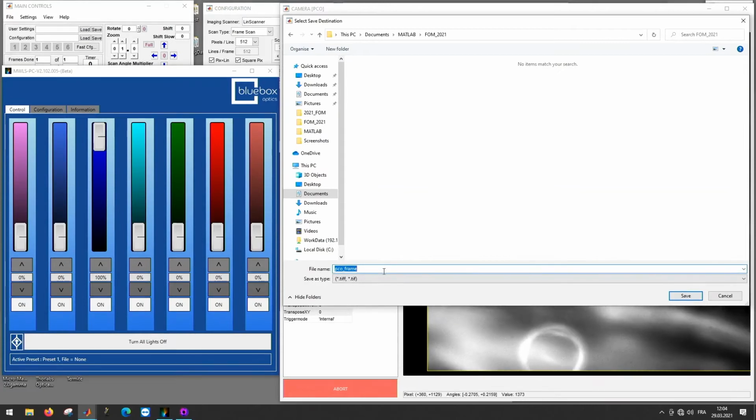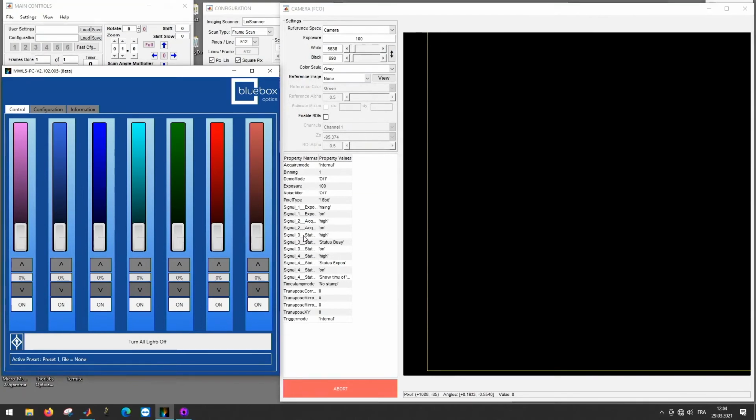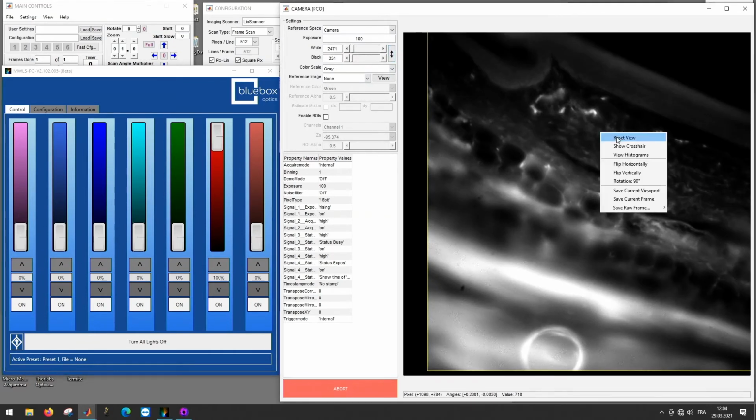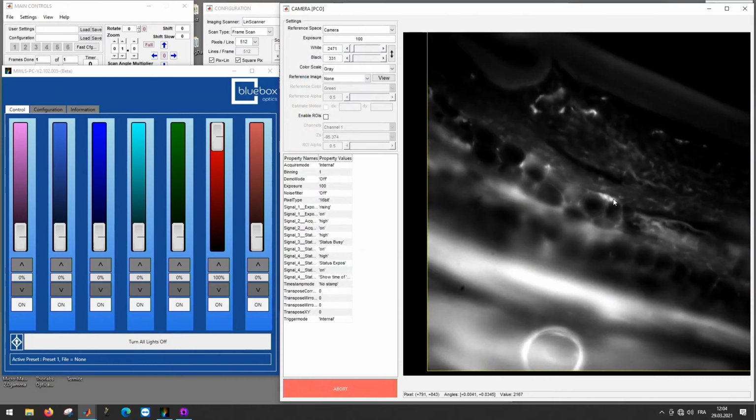All the images that you acquire with this microscope are 16-bit TIFF files, which makes pre-processing of the images very easy. Then we choose another wavelength, for example the red wavelengths, to see some differences in the autofluorescence. Therefore, we choose wavelengths that are not so close together. I also save this image over here. Of course, all of the images that we acquire during this live presentation, I will pre-process, color them and make an overlay image, and we will upload these images on our website, so you can check them out later and give us some feedback.